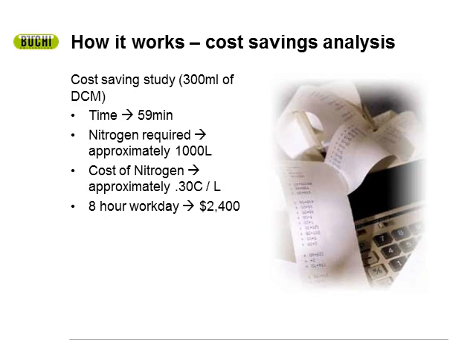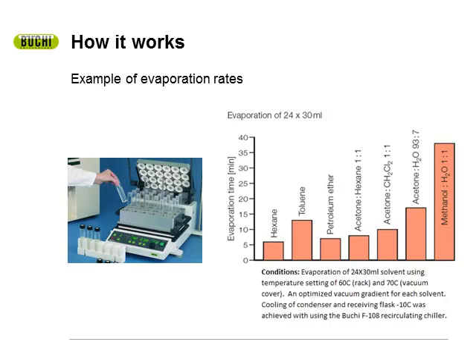That's why we didn't want to go down that path, and we wanted to use something like pressure, which is free. What generates the pressure is a vacuum pump. So yes, there's an upfront cost of the vacuum pump, but after that, there's no upkeep cost.